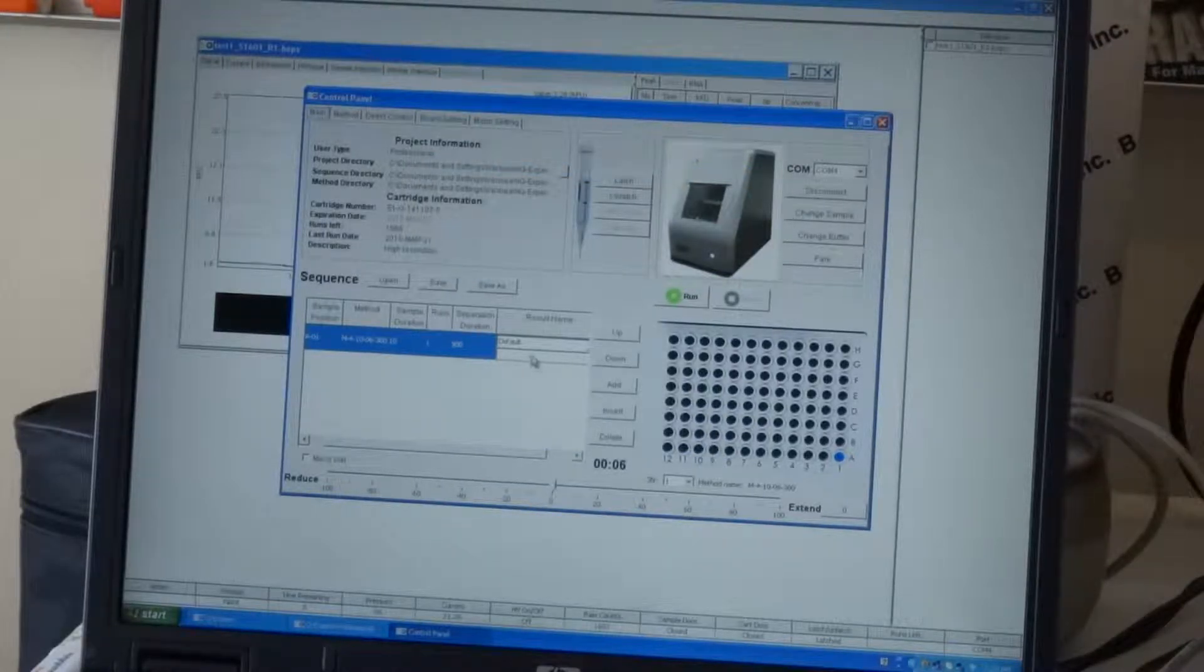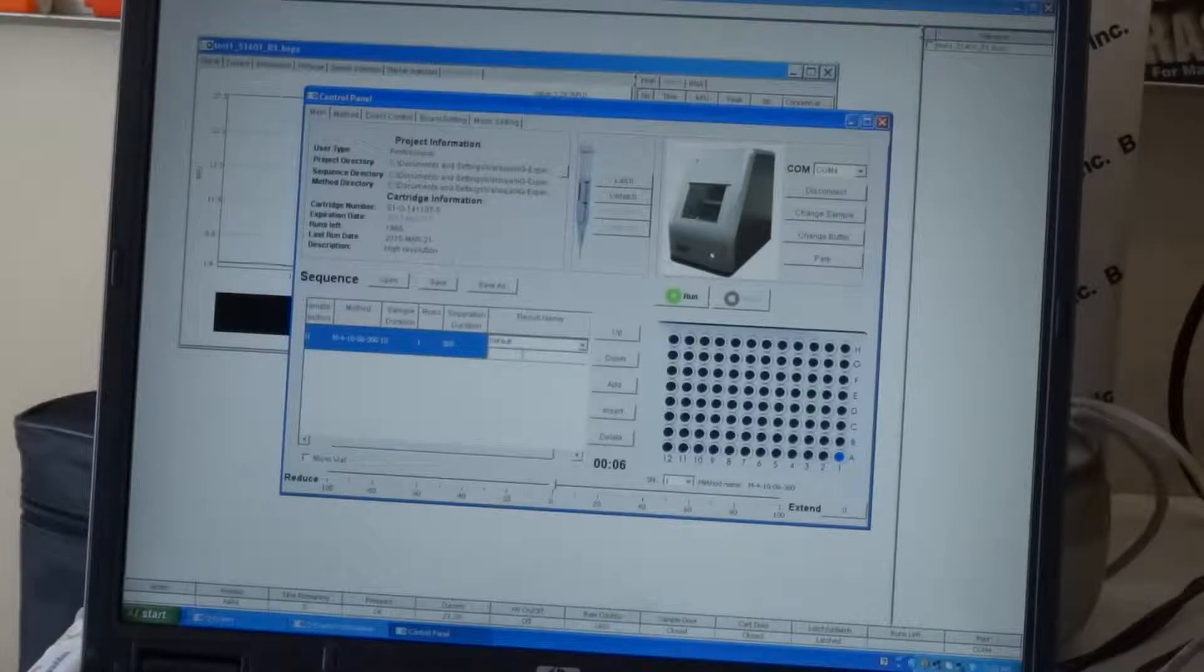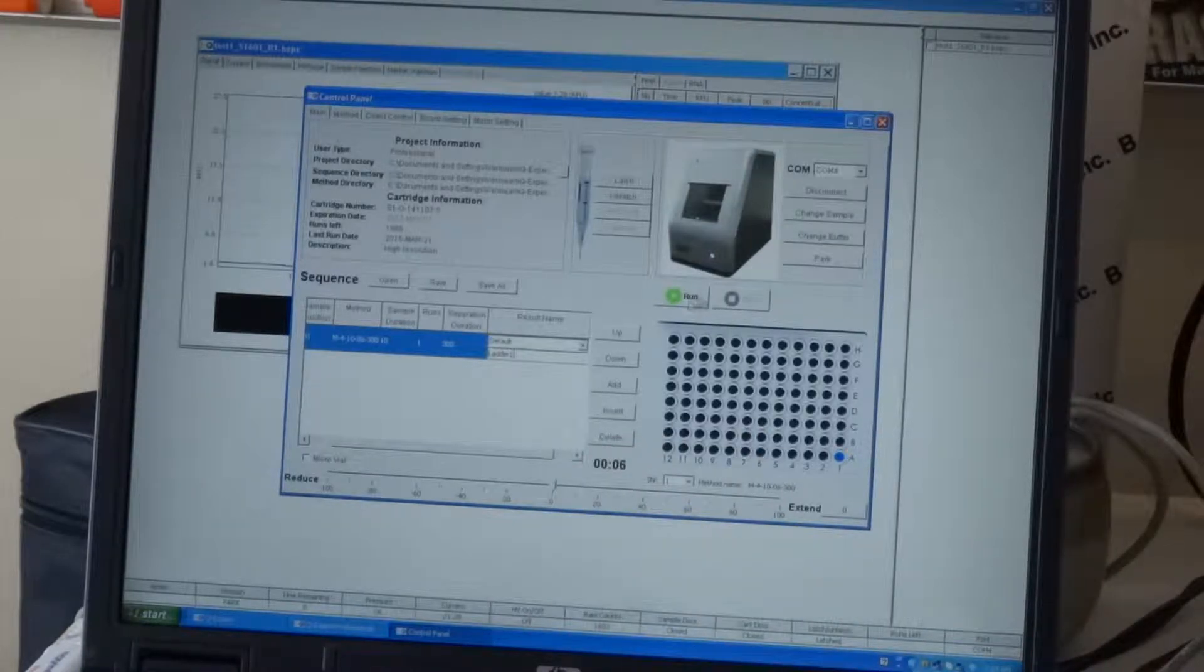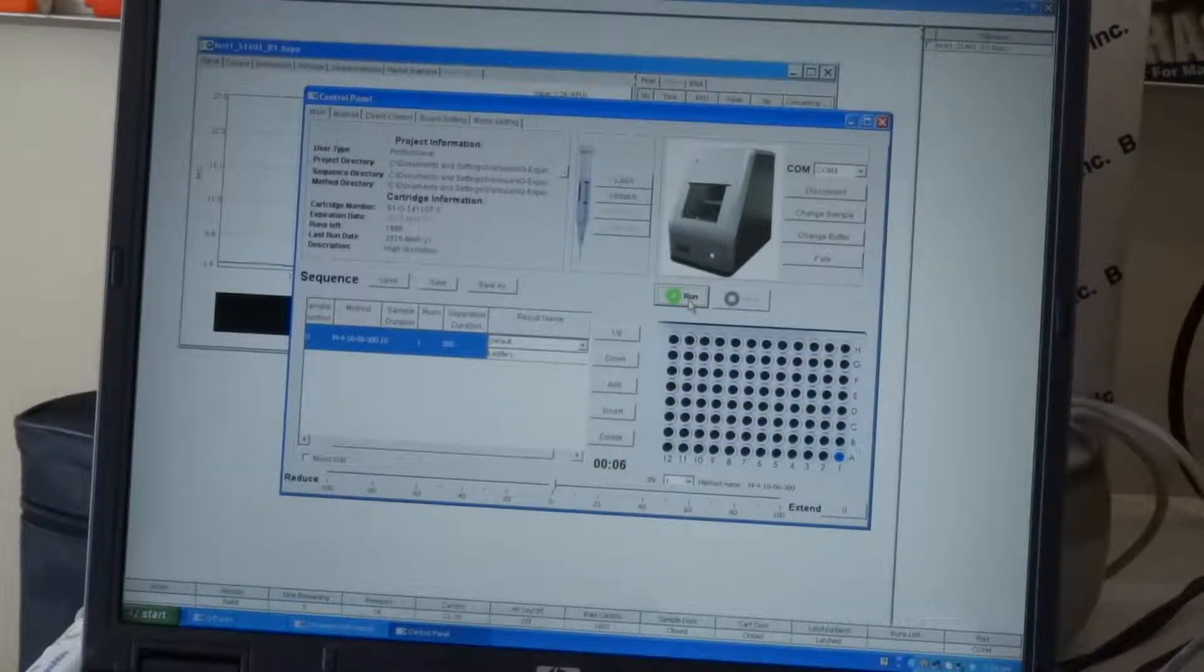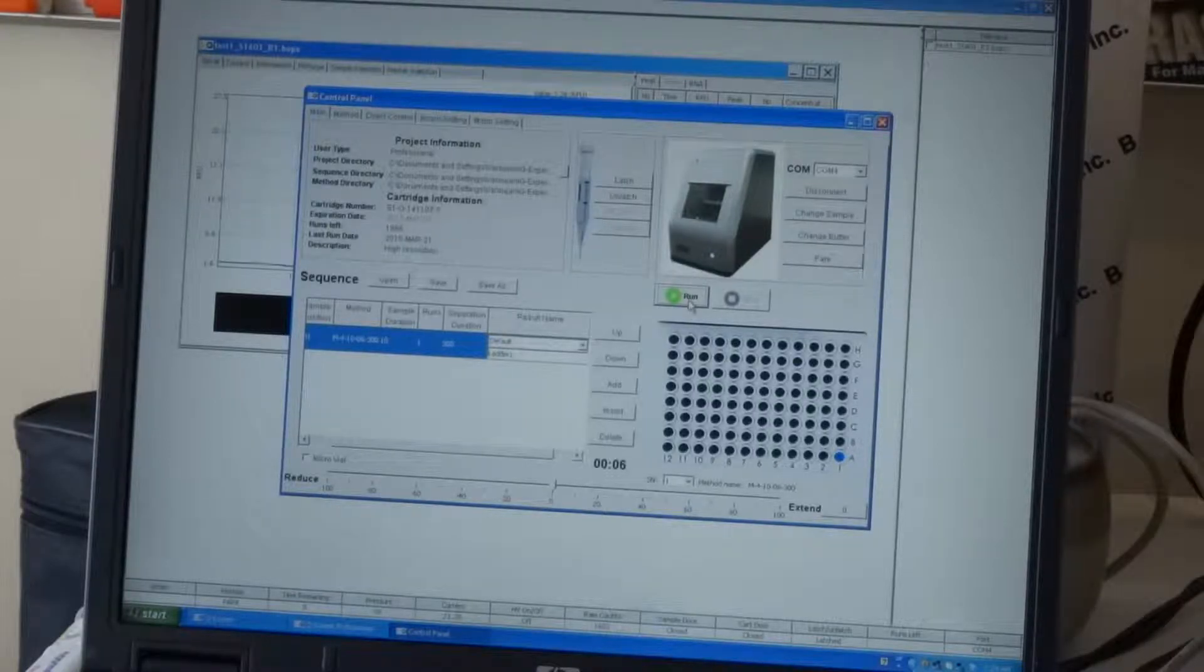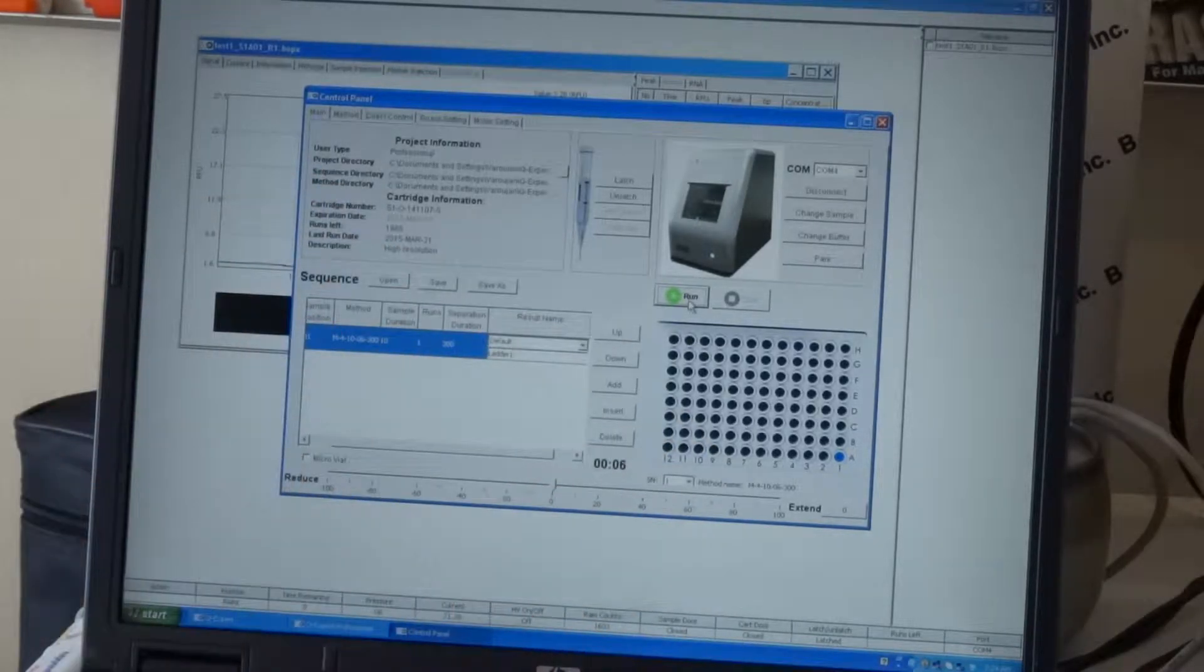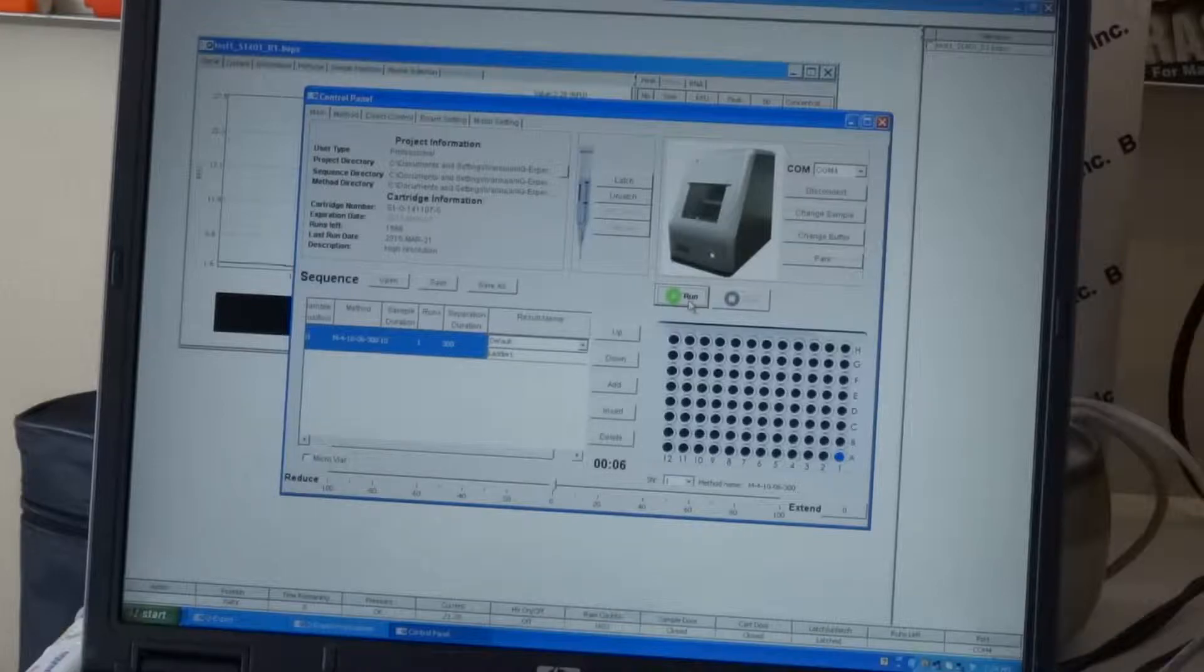You will select this, say OK. And also, you would put some sort of a name for your run. So, for this one, I would say ladder 1. And we're ready to go. And then we will hit the run.